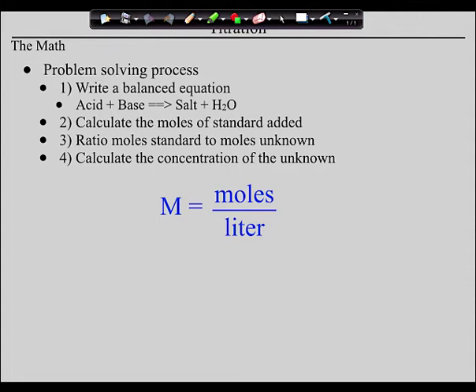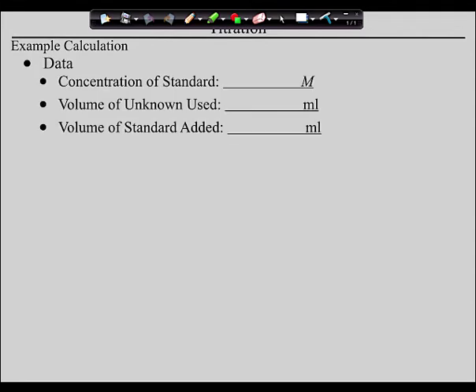You okay? Okay, now, guys, here's what we're going to do. We are now going to go do the lab together. As we do the lab, you are going to collect data. So make a data chart. Do this in your notes. Do not collect any data on the lab itself. We are going to make up our own data chart and we're going to collect all of our data here.